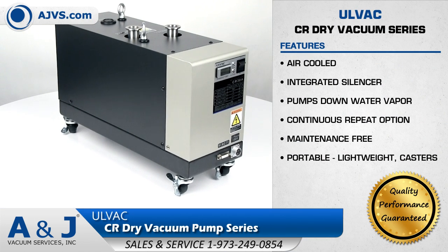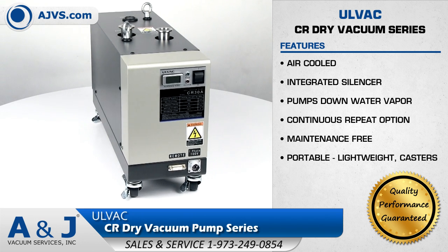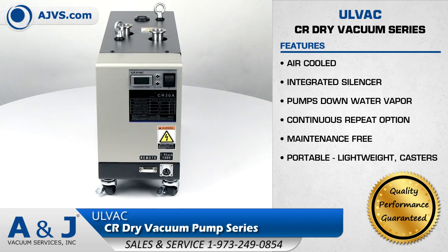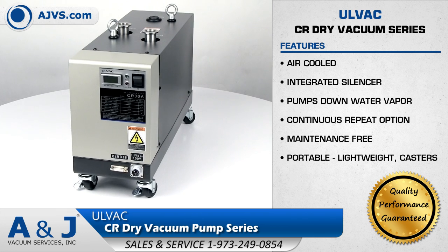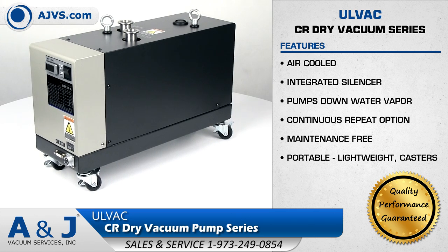The Olvac CR is a compact and efficient air-cooled dry vacuum pump designed for a wide range of applications. The Olvac CR series features exceptional pumping capability, superior vacuum performance, and state-of-the-art design features.